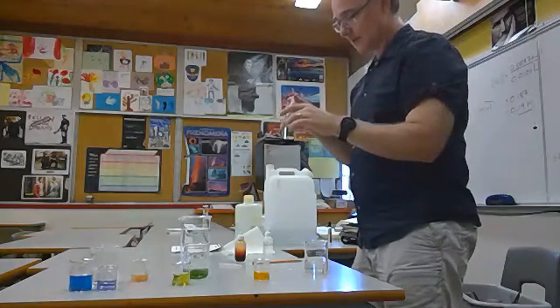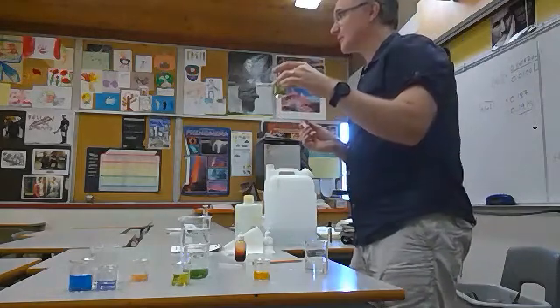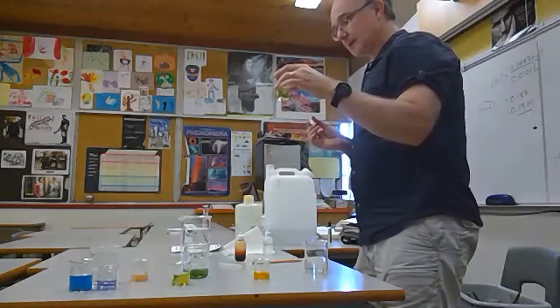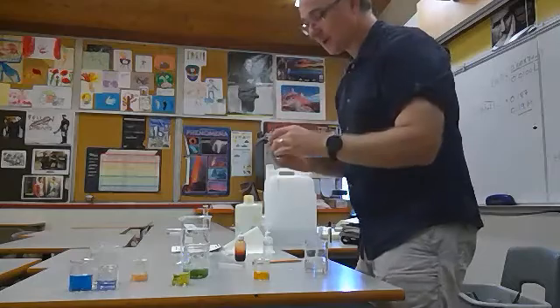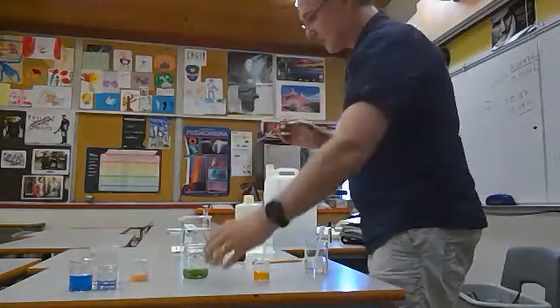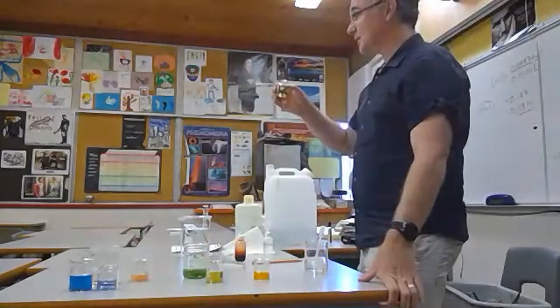So the video can't really show that, but I'm adding huge amounts now. I'm adding probably 50 drops to this thing. And it's still not even the same color as my breath was able to do that, right? So this clearly is resisting pH changes, right?